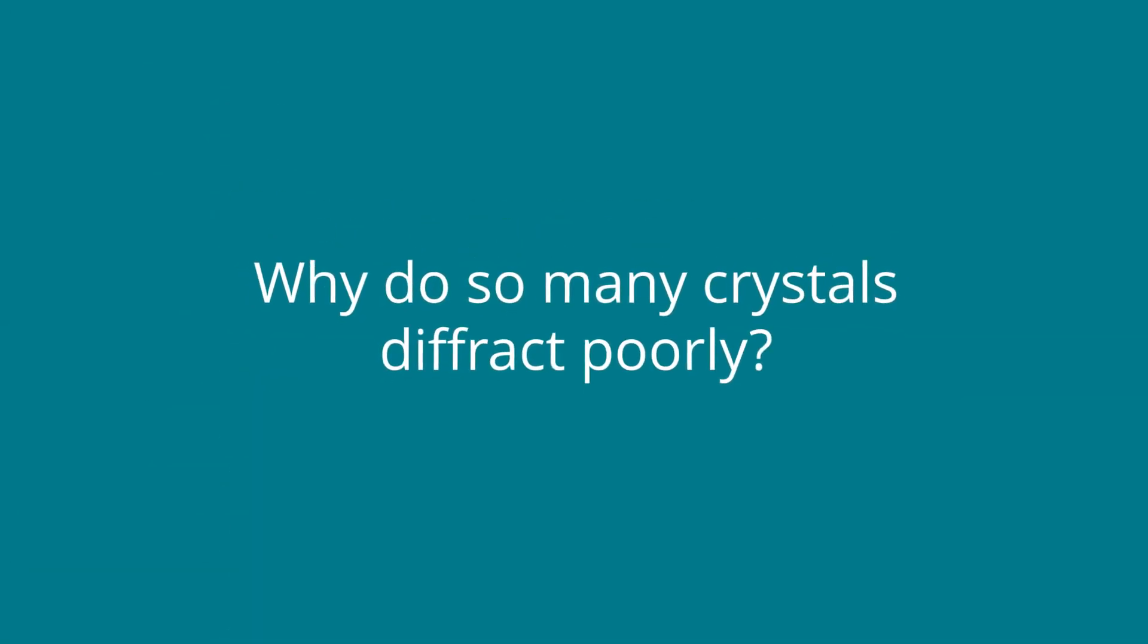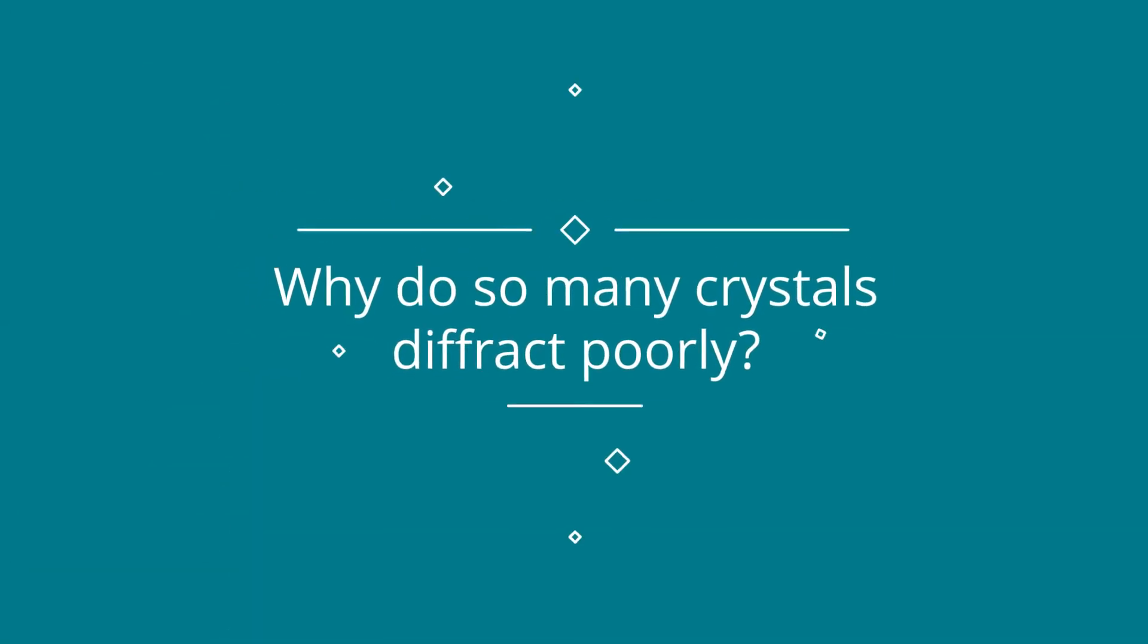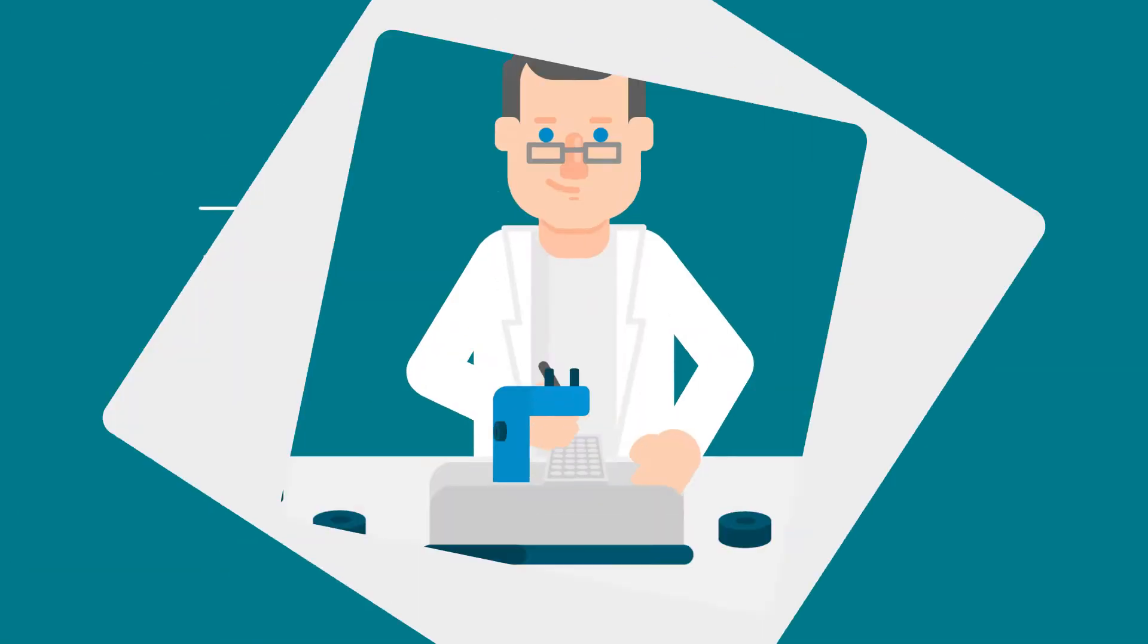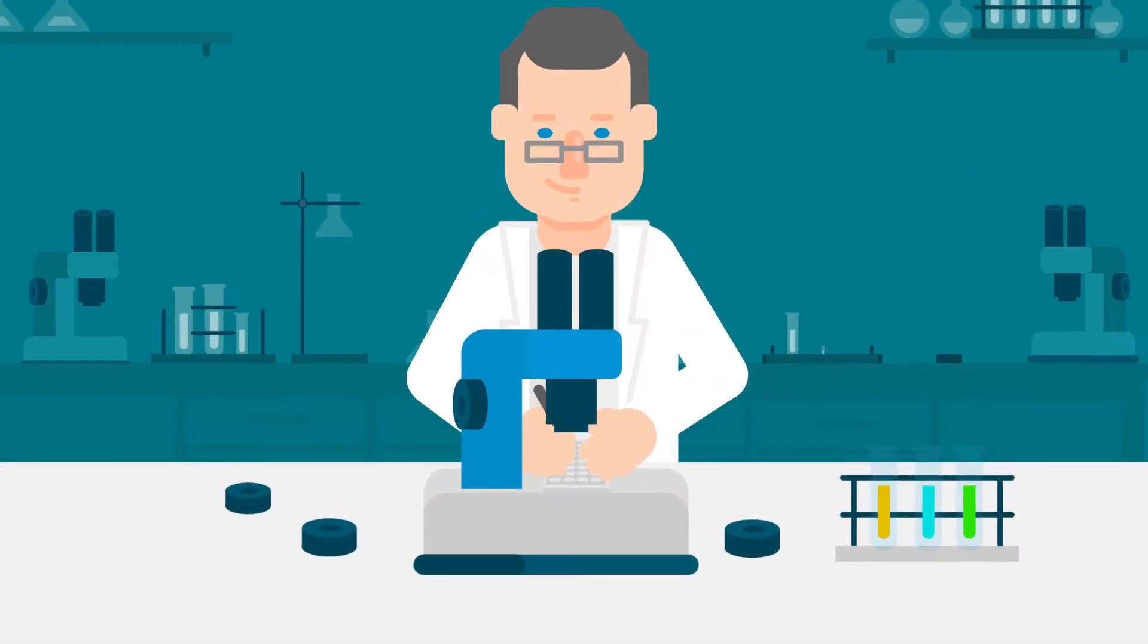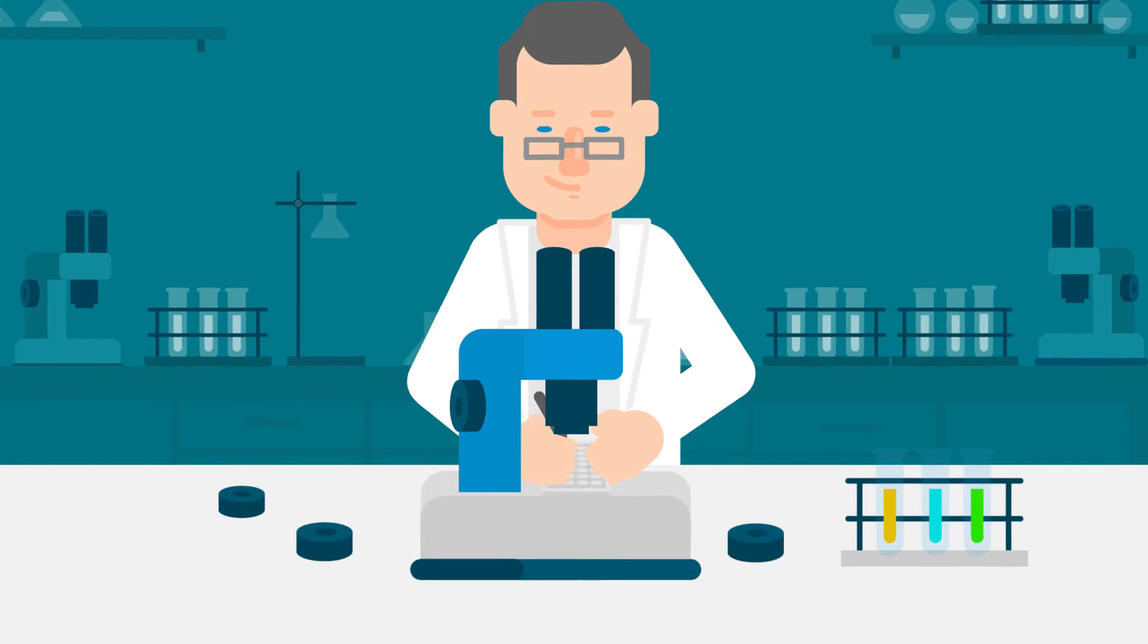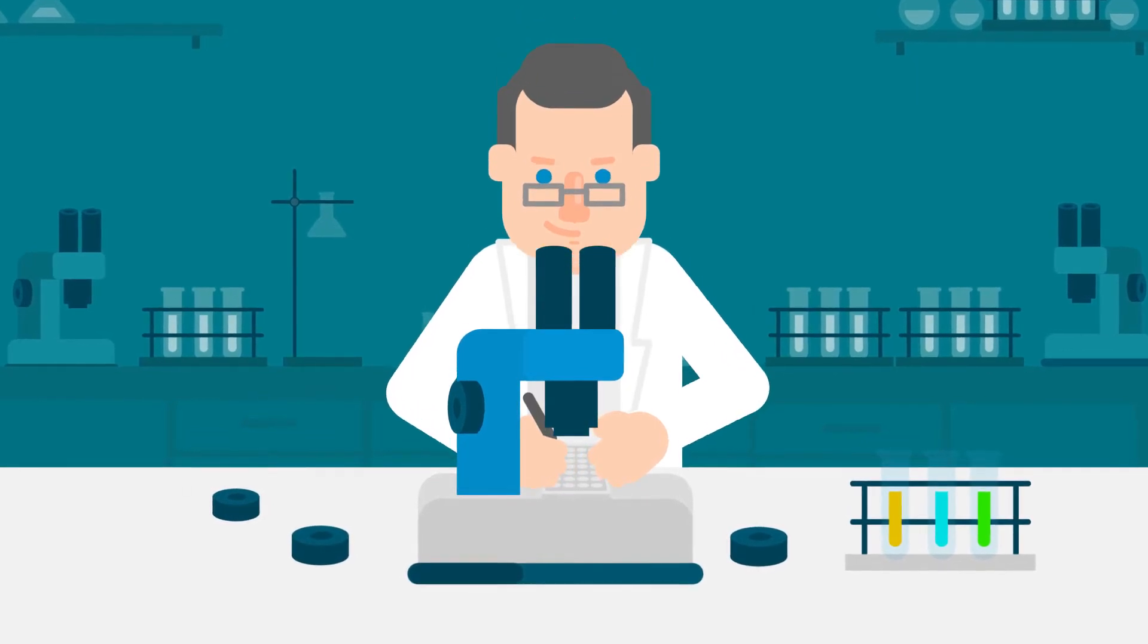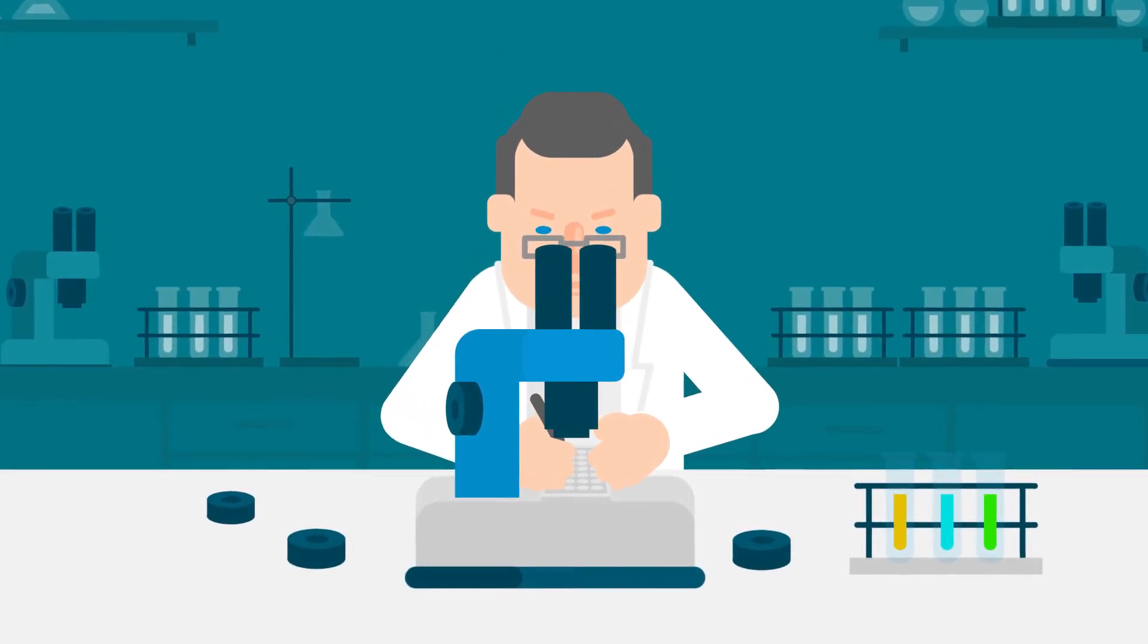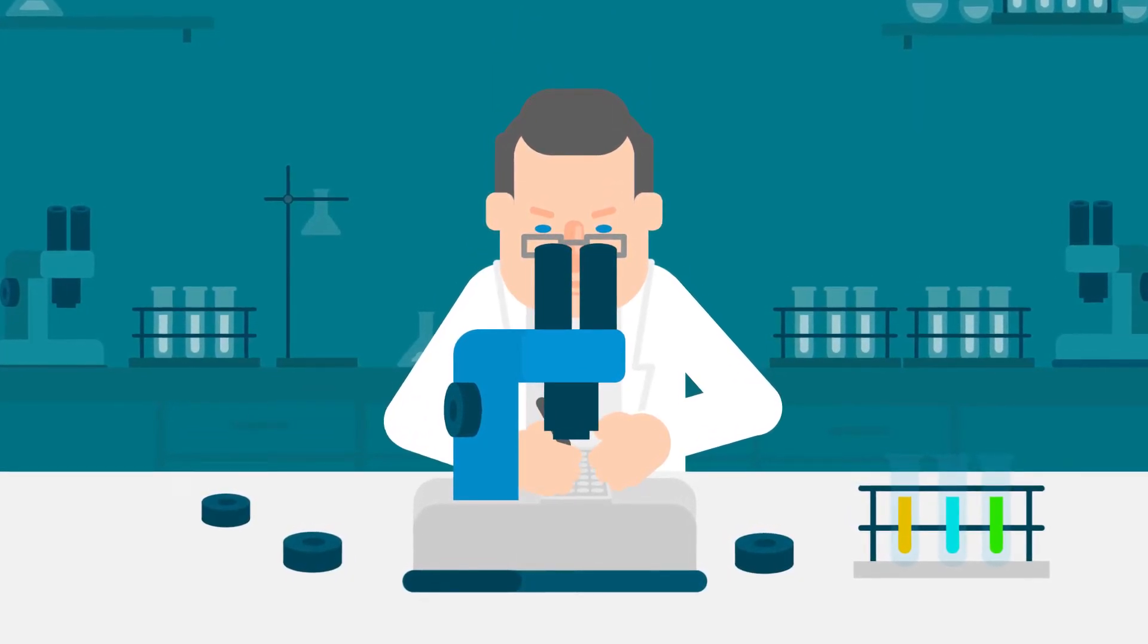Why do so many crystals diffract poorly? One cause is the use of outdated tools and methods during harvesting and cryocooling.